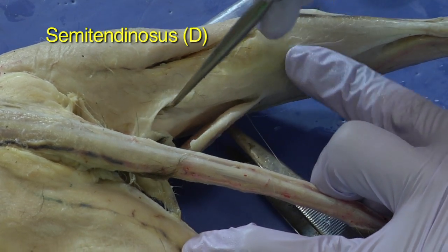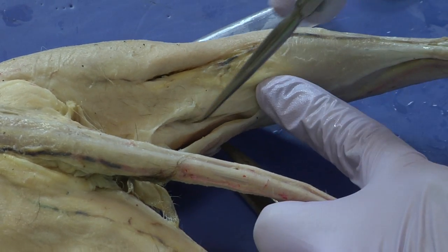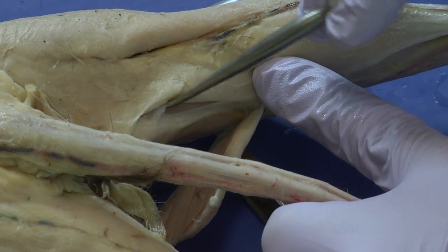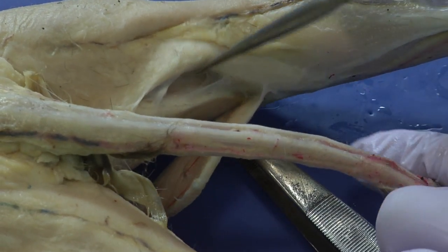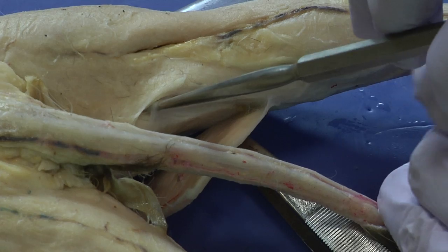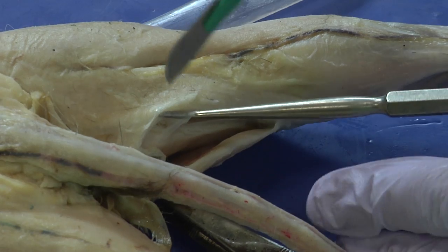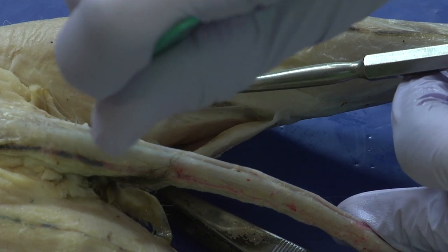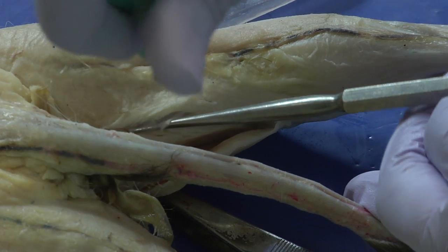All right, so the other boundary point is really in the medial portion of the leg, so dorsal and medial on the back of the leg. And so here's the other. And so what I'm gonna do is just use the probe again as a guide and follow this cut or the separation all the way to the top.